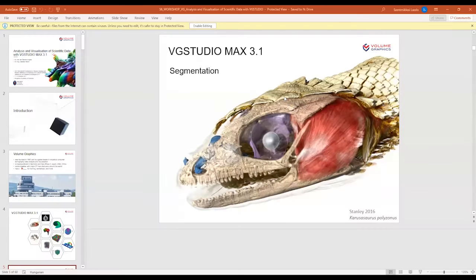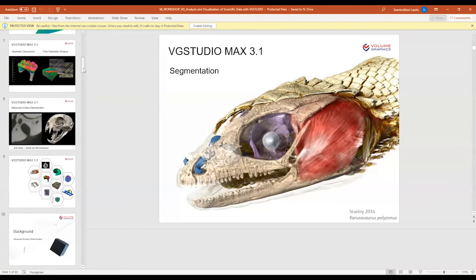So with this image processing, you can spend ages to tune the visual appearance of your data. So such a very impressive and detailed visualization can be done using these programs if you have plenty of time to elaborate the visualization.